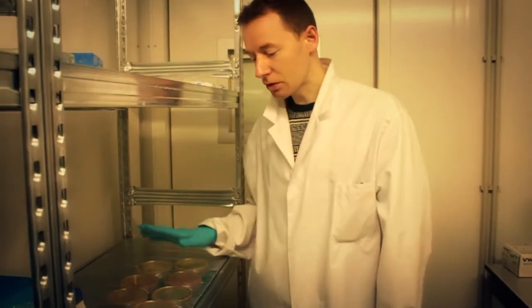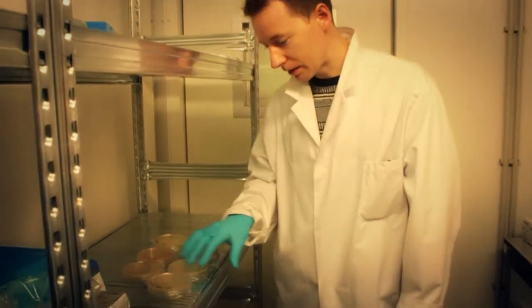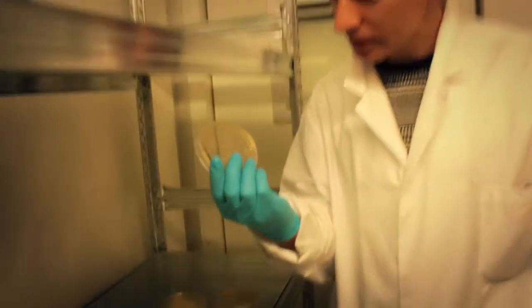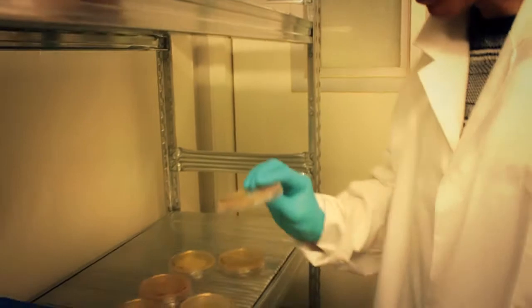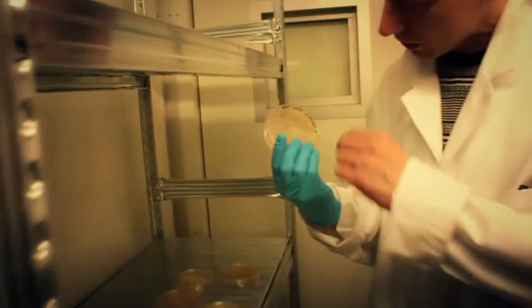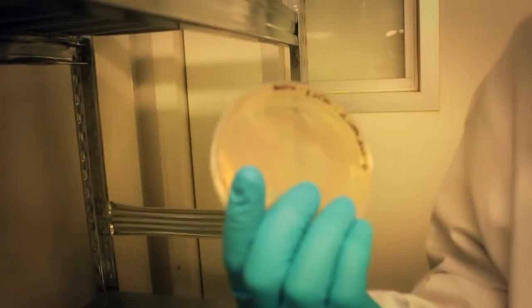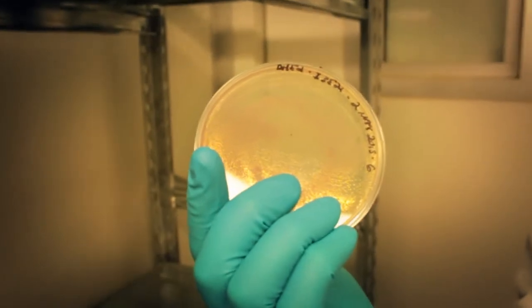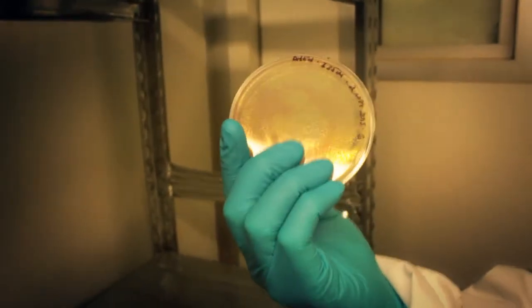But we've just used the red fluorescent protein and you can already see that there are lots of colonies on this. And from some of them that have really a lot, you can actually see the red that is showing up, which is the expressed protein.